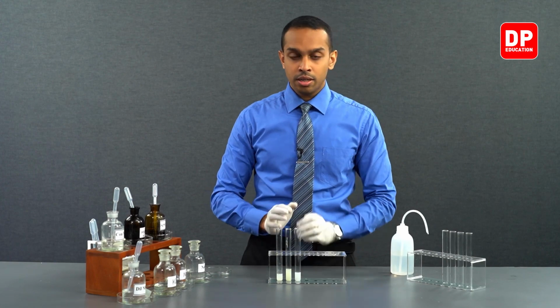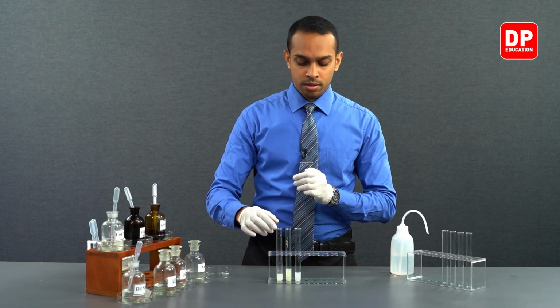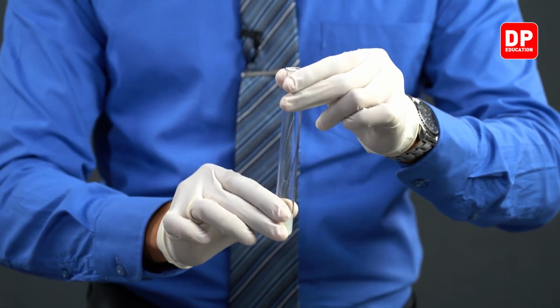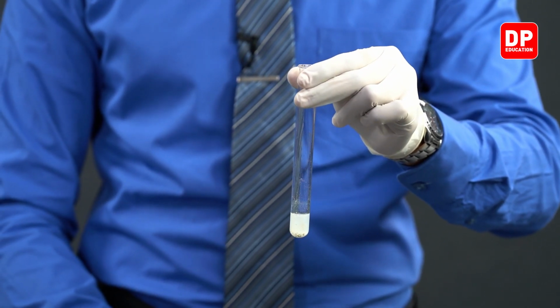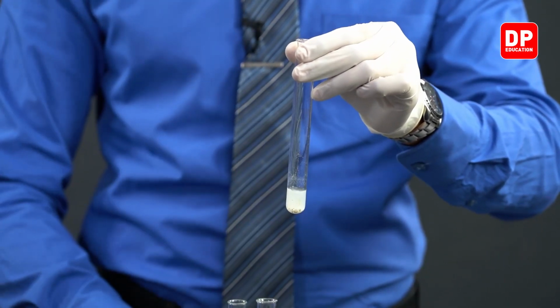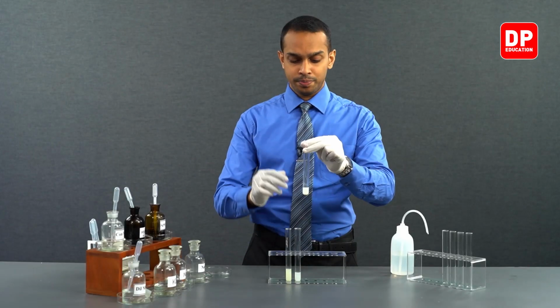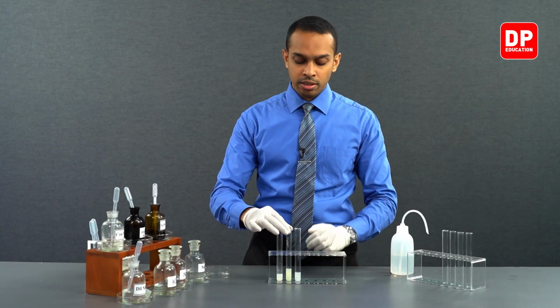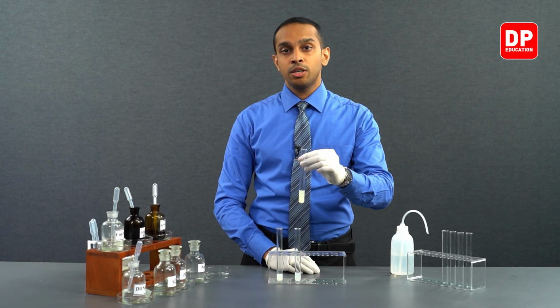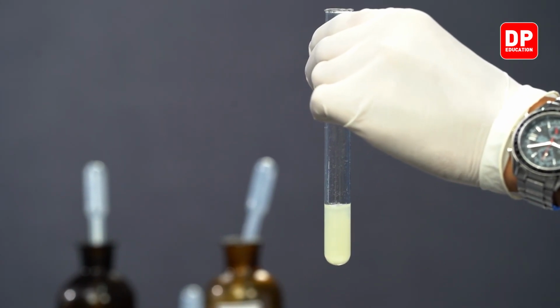So let's go through our observations one more time. As a summary, we initially took a little bit of potassium iodide solution, reacted it with silver nitrate and formed silver iodide precipitate, which is described as a bright yellow color precipitate. And then to a portion of it, we added a little bit of nitric acid. No change took place as nitric acid cannot dissolve silver iodide precipitate.